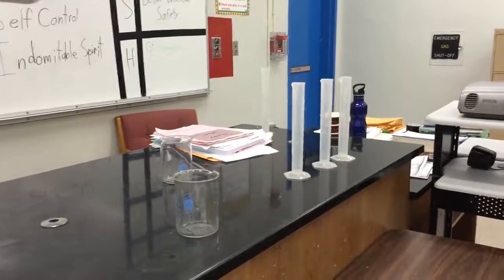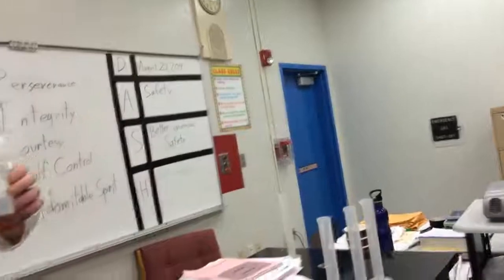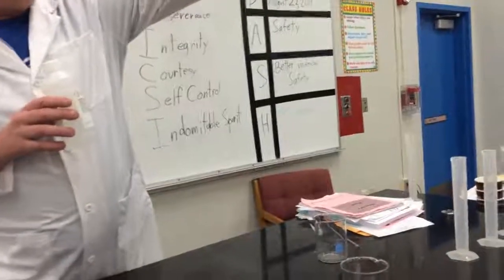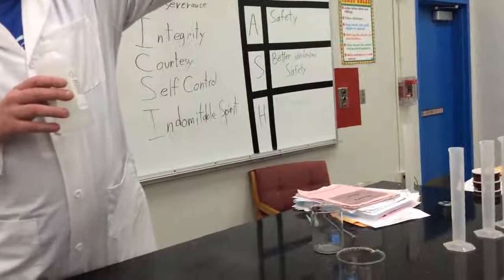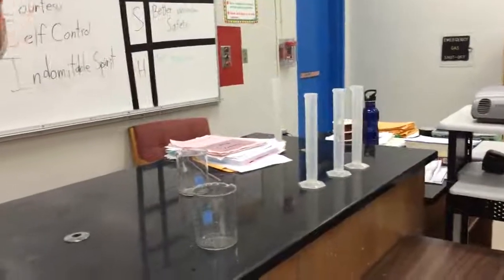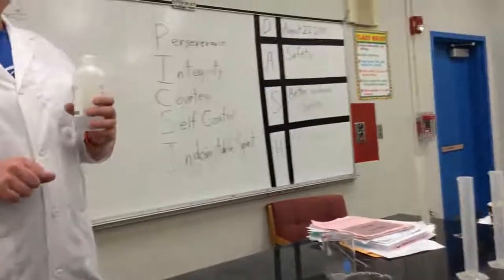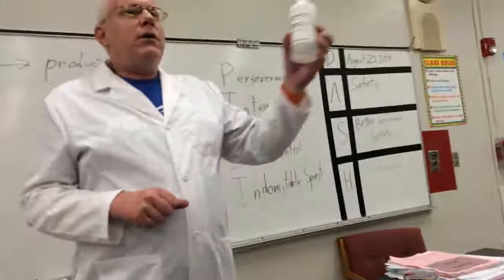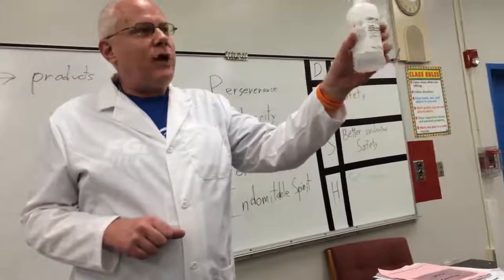So this is one chemical. This is called potassium iodate. And this is like potassium, which is K. Can you find the K on the table? Up there? You see the K? It's like 4 down on the left. That's potassium. And iodine is I. Can you find the I? The I is at the bottom right. Somewhere around there. You see it? So in this bottle is potassium and iodine dancing together.